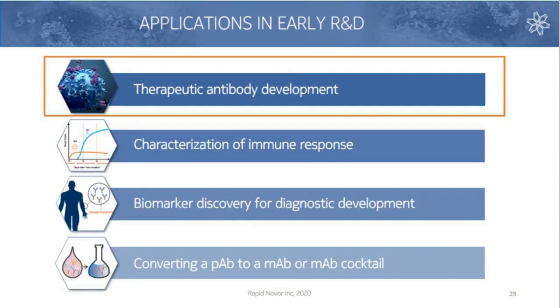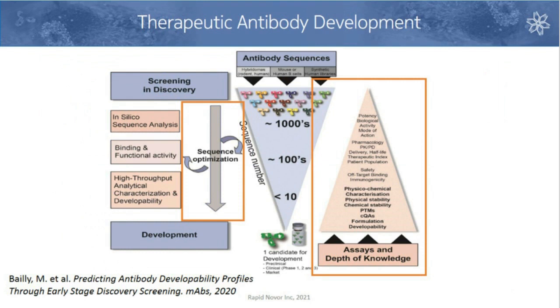So, particular applications in mind. Of course, some of you are sitting here today looking at your therapeutic antibody development programs and wondering if this can plug in. I would hope that it can, and I'll talk about that here. Many of you have seen this kind of thing before: the notion that you're starting off with thousands of different antibodies that might bind against your target of interest.